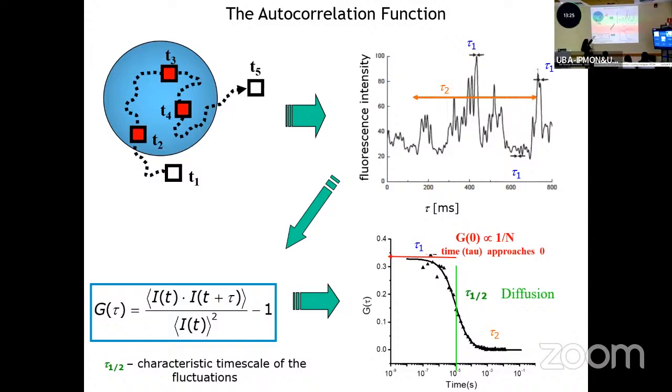And this correlation function enables us to now plot the graph, since we have many molecules, right? So we're not just correlating one time point and then the next time point. We're doing a shift to correlate each time point. And you'll see that at a very short time scale, we have a high probability of seeing that molecule.